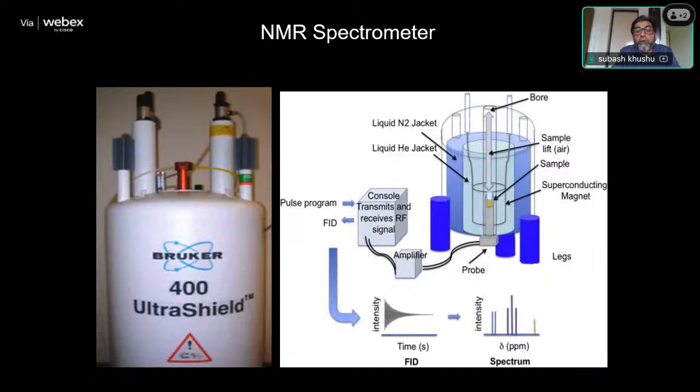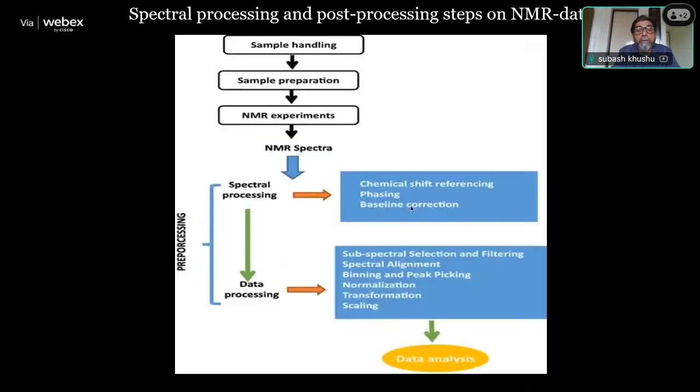So this is a spectrometer. I think we have talked about NMR, MR instrumentation a lot. So basically everything is the same, except you have a vertical bore, and from the top you can inject the sample into the probe and do the analysis.